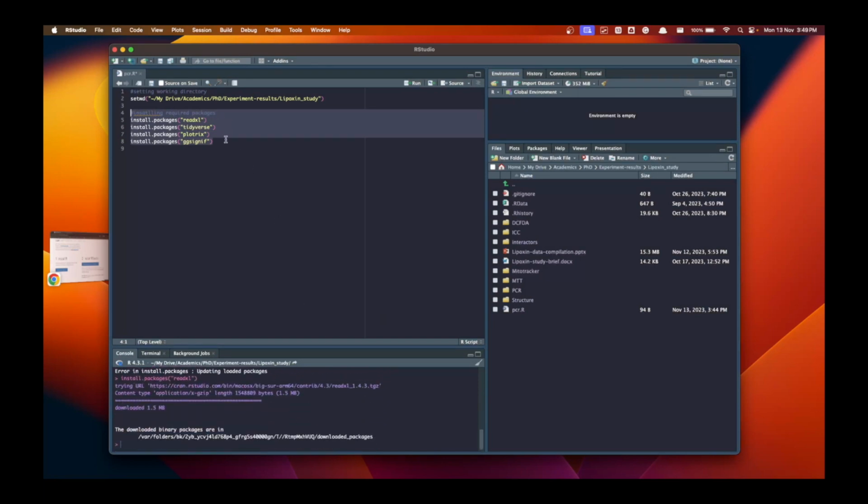And yeah, they would run some code under the hood, and your packages are going to be installed. So once you install the packages, the next thing that you want to do is import the libraries, import the packages into your RStudio. Right now, if you call any function from these libraries that you've installed, it won't work, because they are just downloaded and installed onto your system.